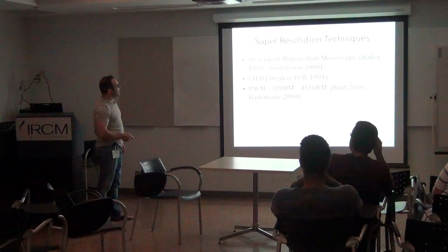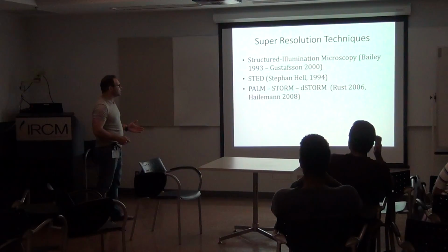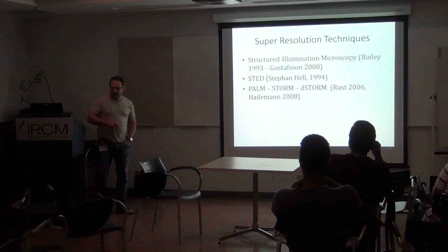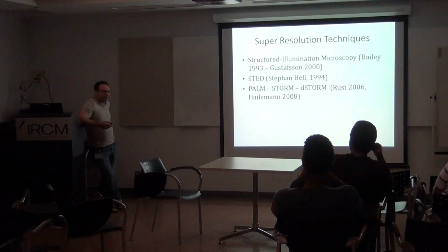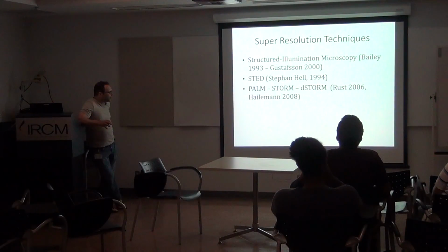Okay? And so super resolution techniques arose, maybe since 1993, I would say, or 1994, when some people had the idea of looking at their specimen at different time points.